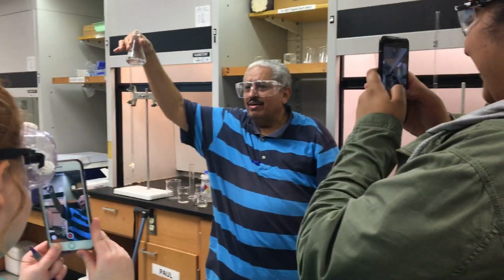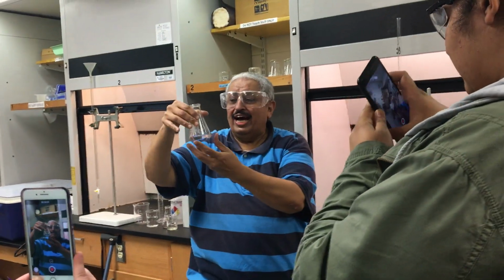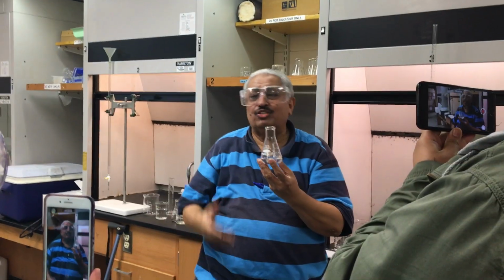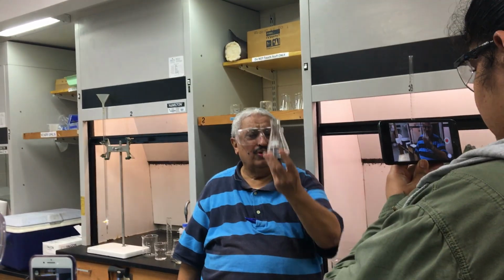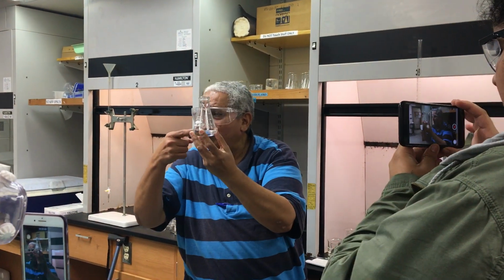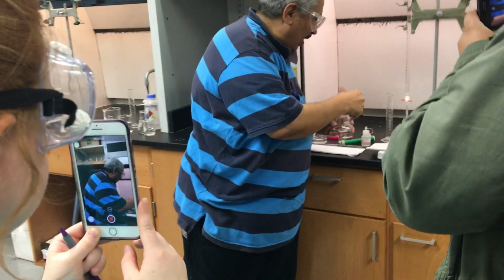The color is gone. What's happening? It was basic from one drop of sodium hydroxide. But I added an acid to it, carbonic acid from my mouth, CO2 plus H2O. That's in your soda, correct? The fizzing gas, that's carbonic acid, CO2 gas dissolved in H2O. Now it's back, correct? If I need it to be pink again, let's add one drop of sodium hydroxide. Here it is.